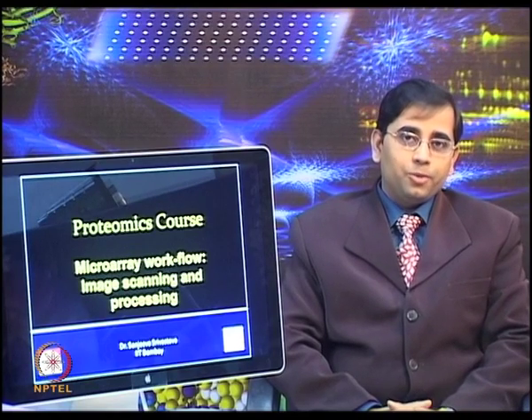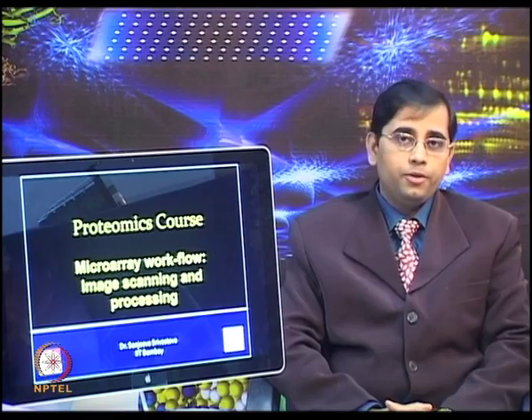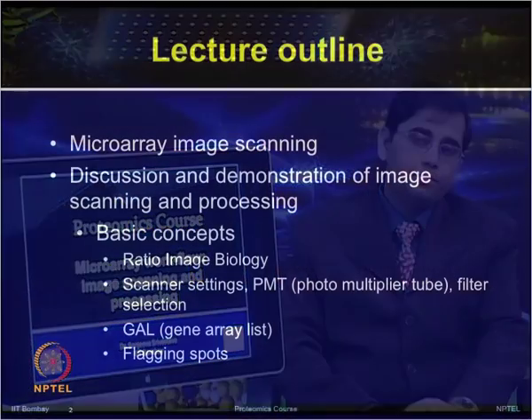Welcome to the proteomics course. In today's lecture, we will talk about microarray workflow, the image scanning and processing. This is in continuation of our discussion on microarray workflow.